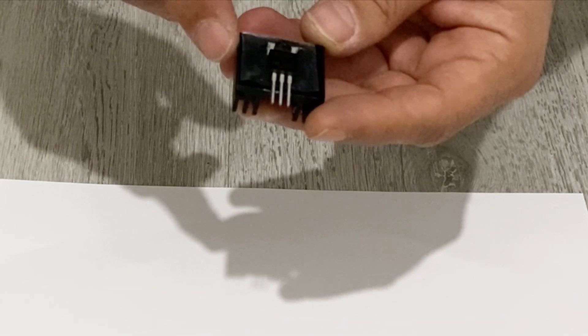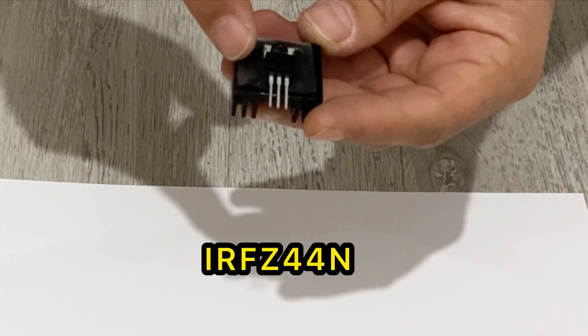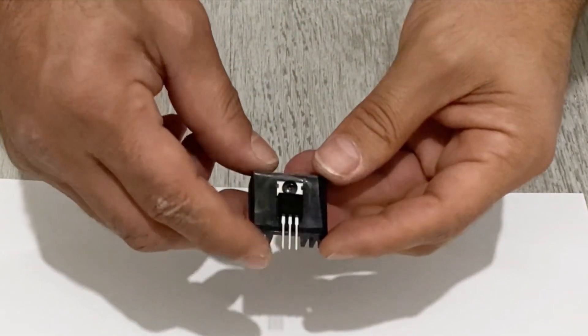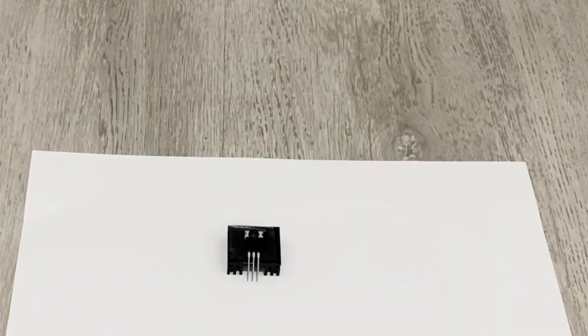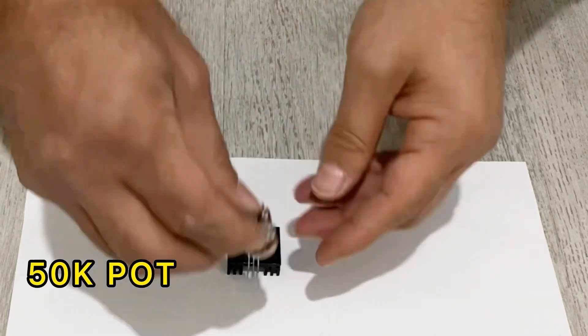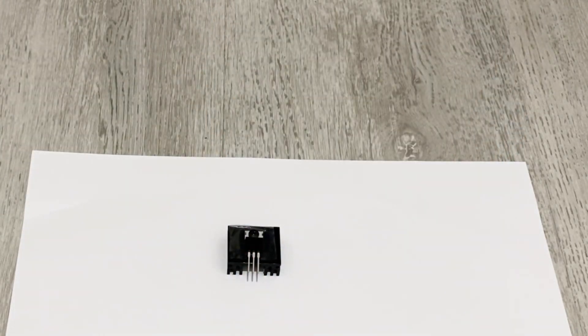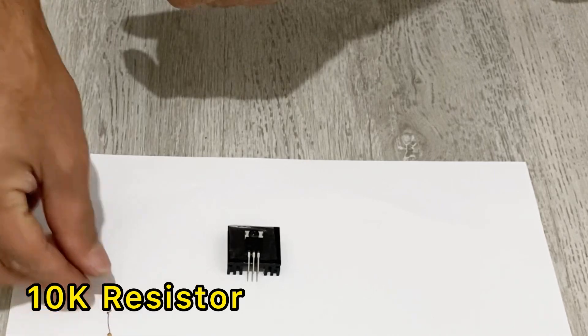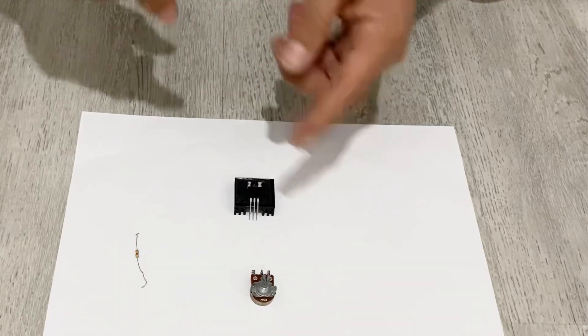Now I need a voltage regulator. I am going to make my own and I will show you step by step how to do it. For my voltage regulator I am going to use an IRF Z44N integrated unit. I also need a 50k potentiometer, a 10k resistor, and some cables of course.